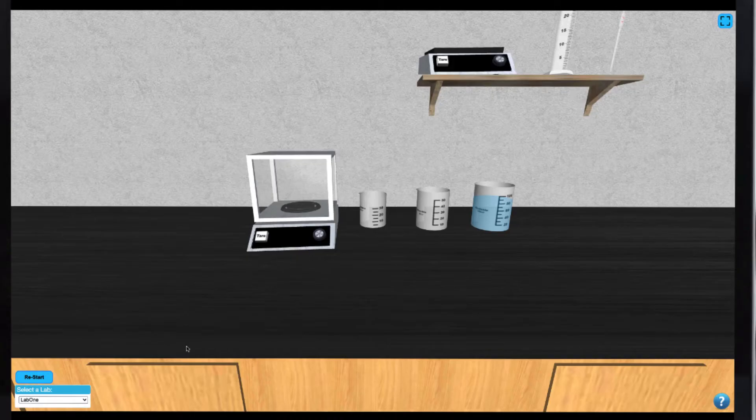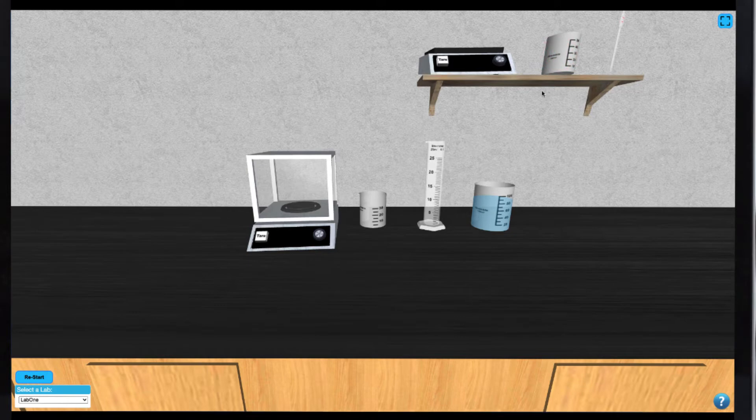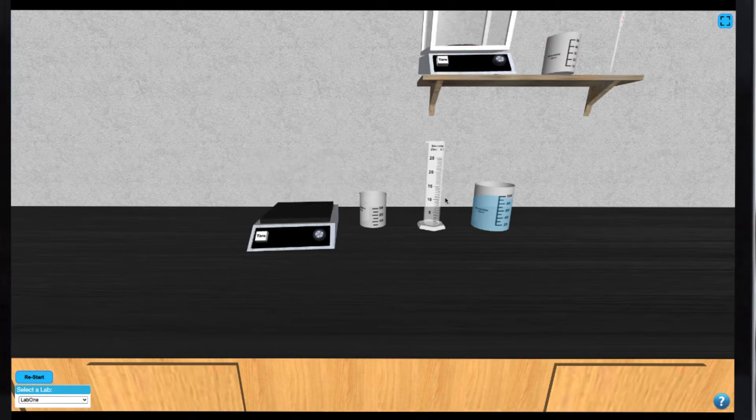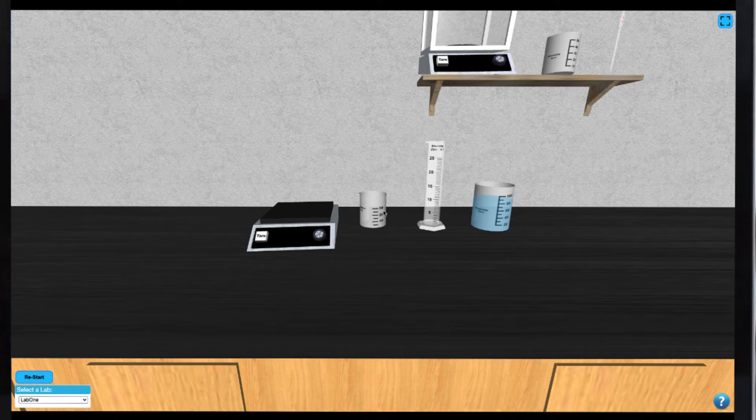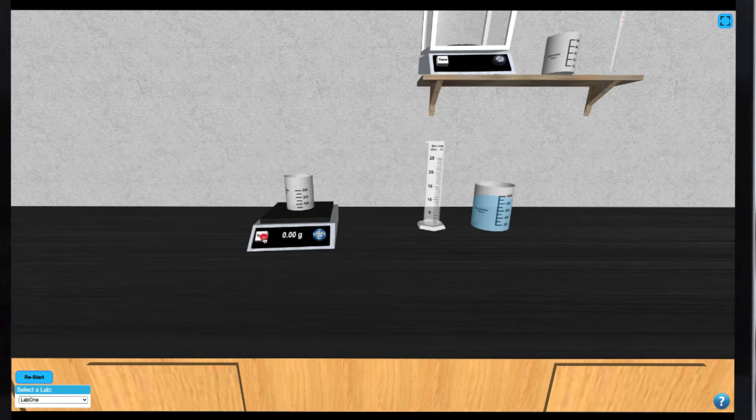To select any of the equipment on the shelf, simply click on them. To make a measurement, first place your 30 mL transfer beaker on the balance by clicking on it and turning the balance on. Then you can tare the mass of your 30 mL transfer beaker.